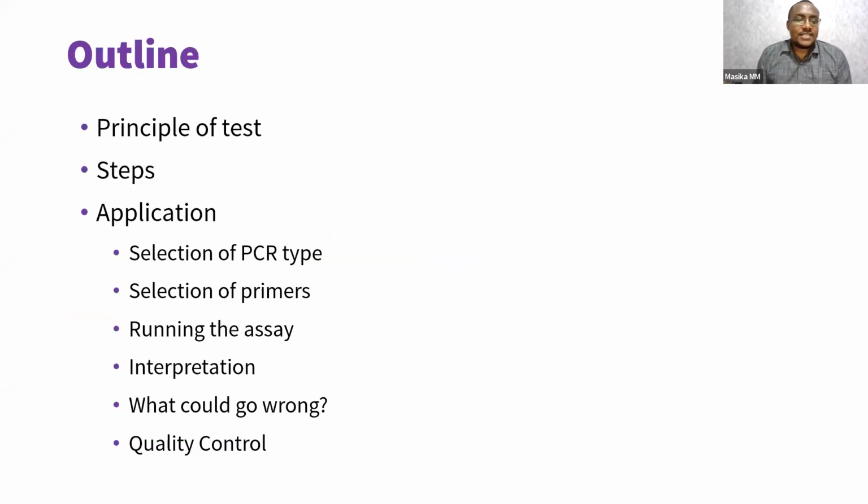The outline for today's class, we'll be looking at how this test works, which has actually been described fairly well by that video. We'll look at the steps of PCR and the reagents required, and we'll also look at some of the types of PCR and how we apply them.